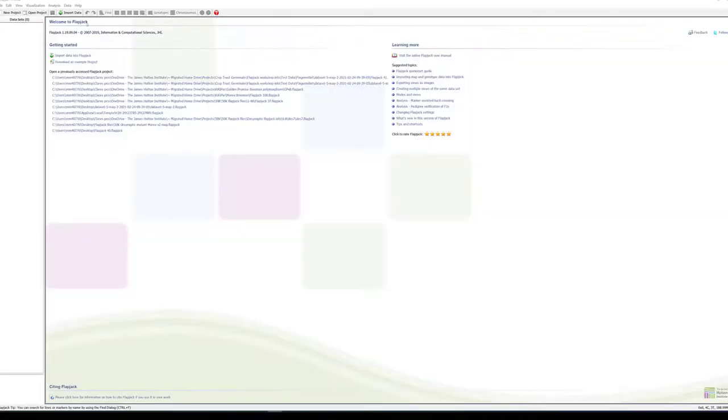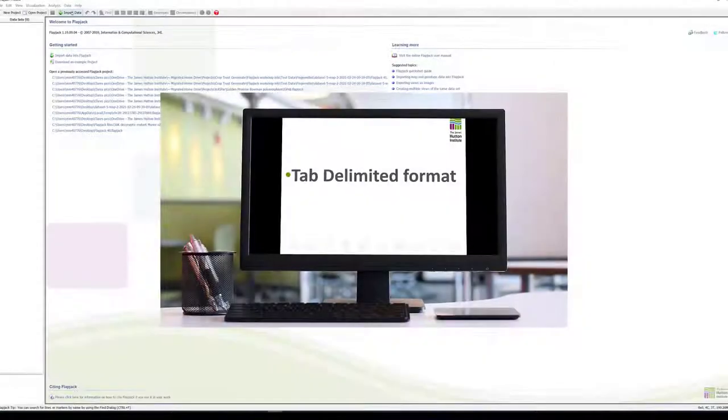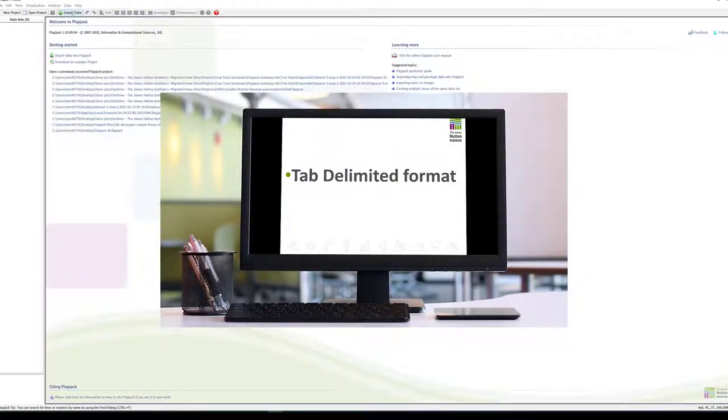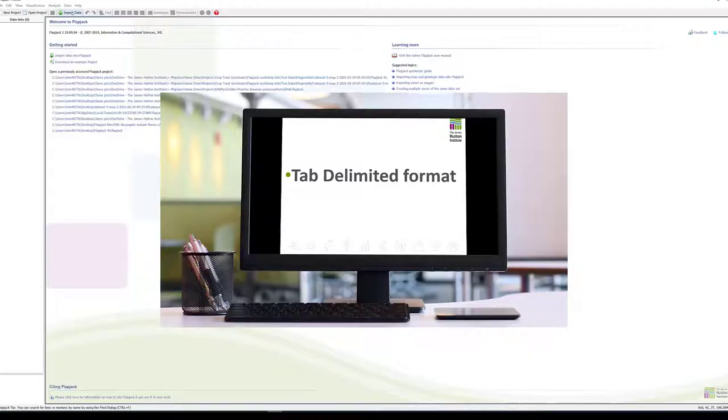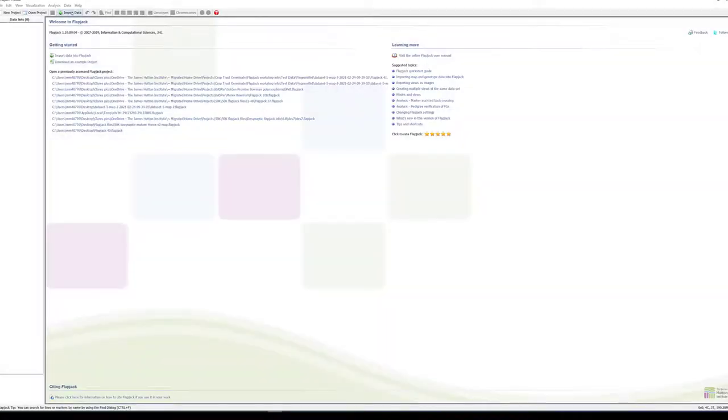Four basic file types can be imported into Flapjack and input files should be created in tab-delimited format. The examples we'll look at have been created in Microsoft Excel. Let's look at examples of each file type.